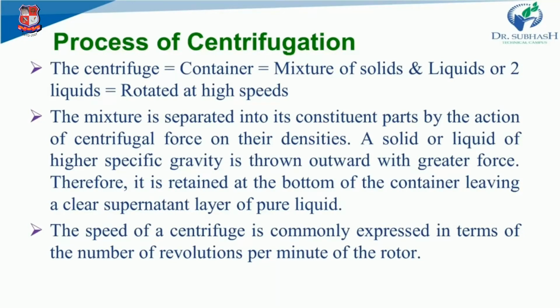Here, when the mixture is introduced inside the equipment, that is centrifuge, it is separated into two parts, right, by the action of centrifugal force. Why? Because they actually have different densities, right? A solid or liquid of high specific gravity is thrown outward with a greater force. Whoever has the high specific gravity will be thrown outside, right? It's just like a tornado or a twister. Therefore, it is retained at the bottom of the container, leaving a clear supernatant layer of pure liquid.